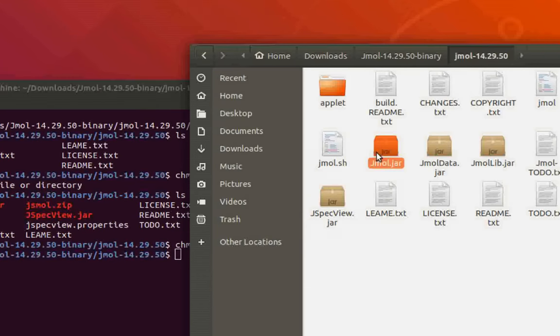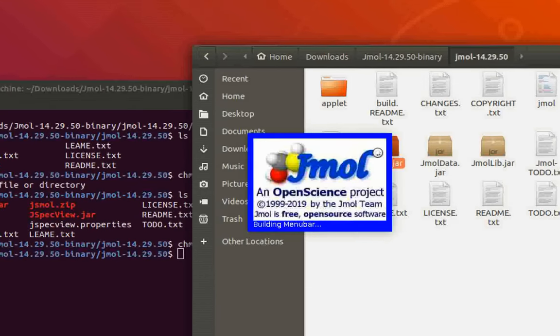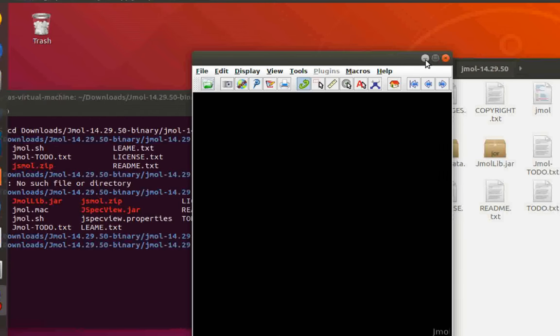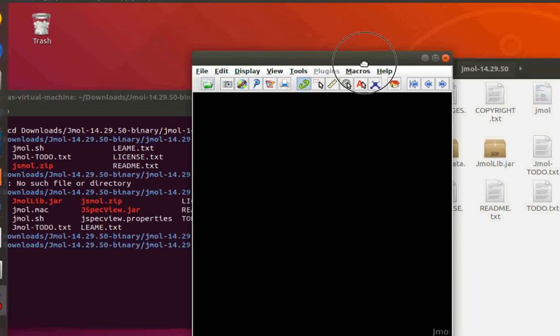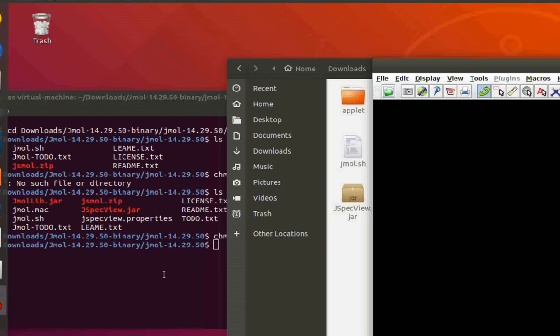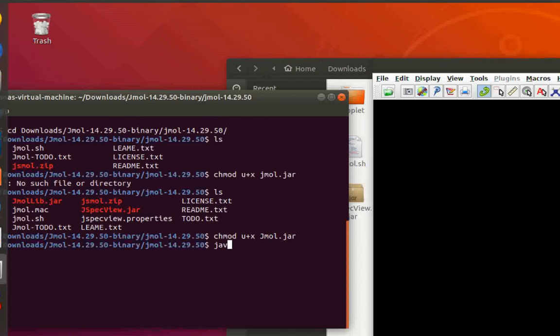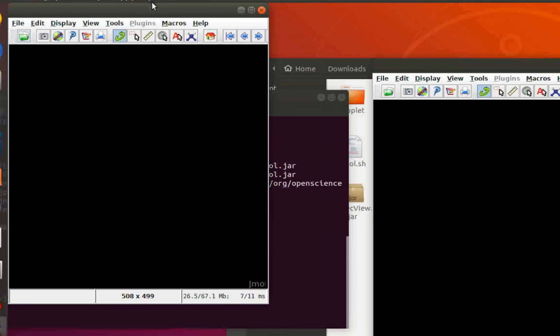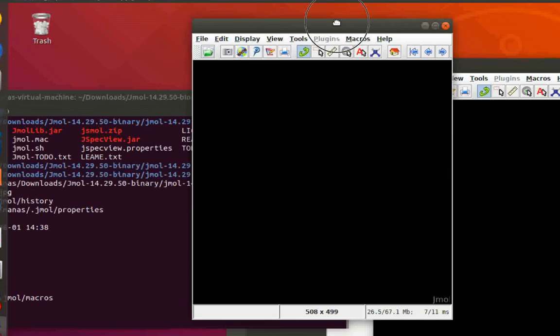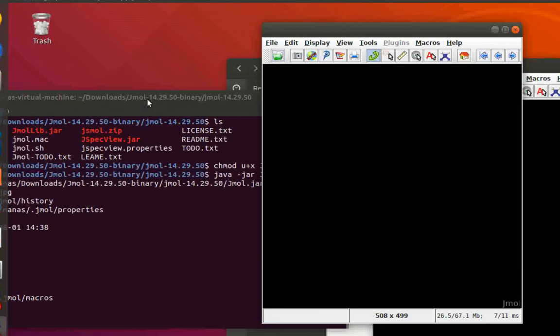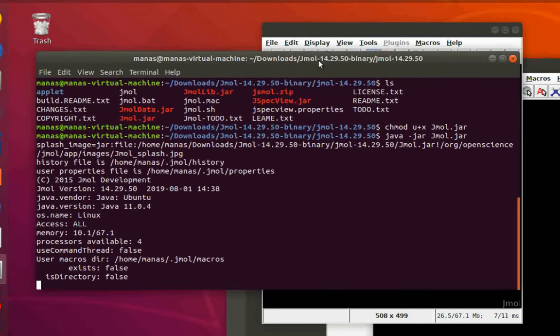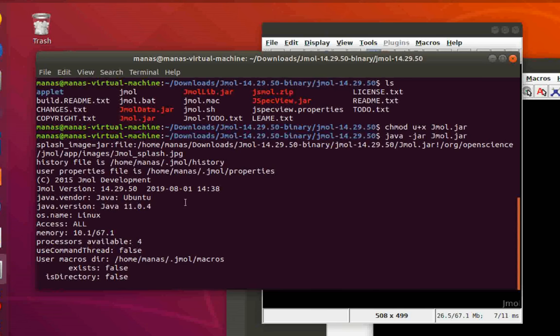Now if you come back to the directory and double-click on it, it will launch Jmol. And voila, here is your Jmol! Another way to launch Jmol is to use the command: java -jar jmol.jar. As you can see, this also runs Jmol using the terminal. In this case, you'll also be able to see all the command line statements when you're running Jmol.